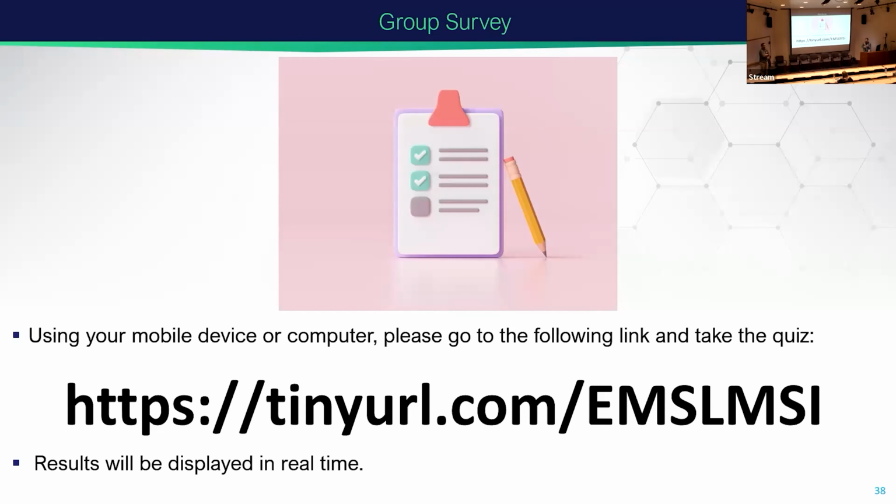So that's kind of the difference, I think, in the data size there. And there are also those universal imzML files that can always be shared; they're much smaller in size. So yeah, you can think about that as well in terms of sharing data.